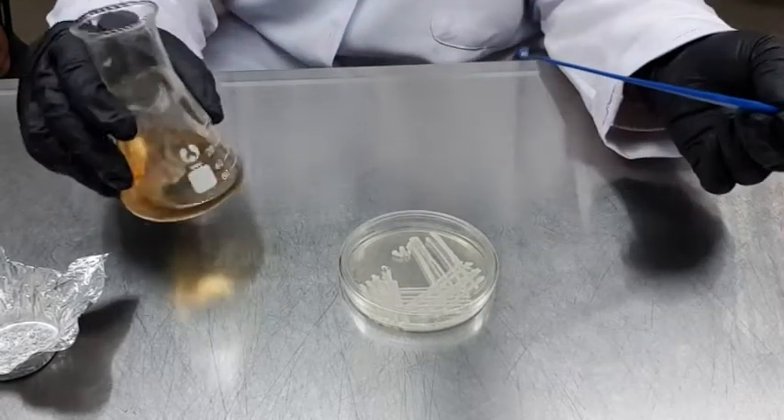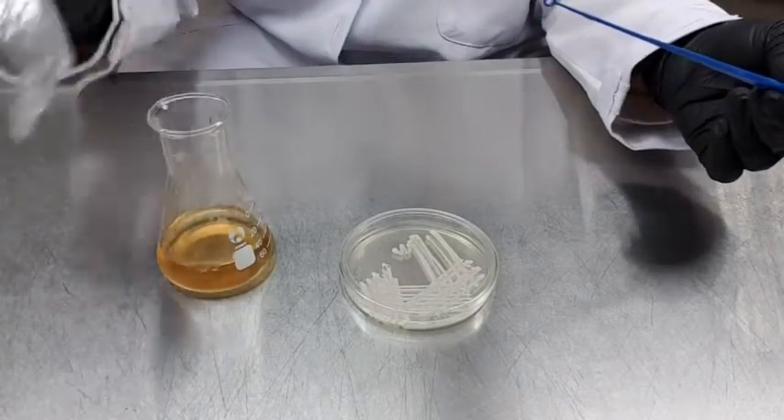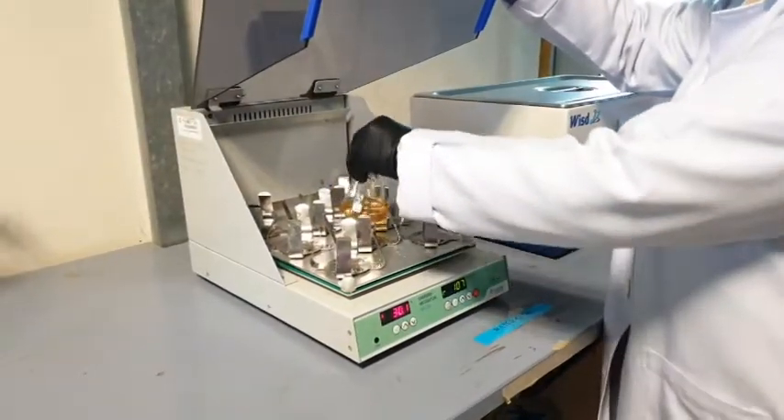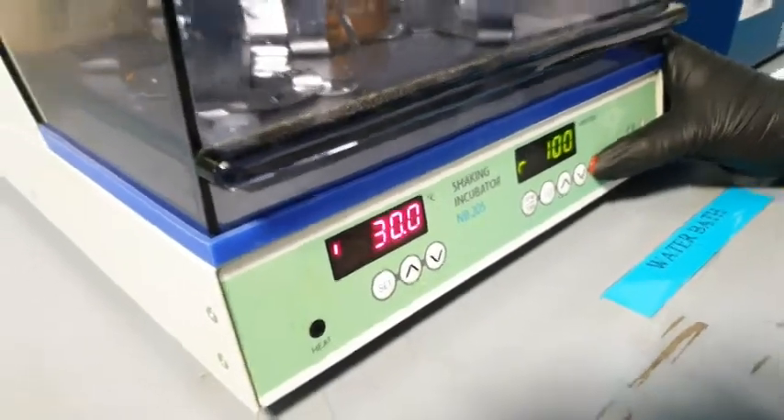Swirl it inside the inoculation media until it detaches from the loop. Shake the flask gently. Cover the flask by using aluminum foil. Then, the yeast culture will be incubated in an incubator shaker at a temperature of 30 degrees Celsius for 12 hours.